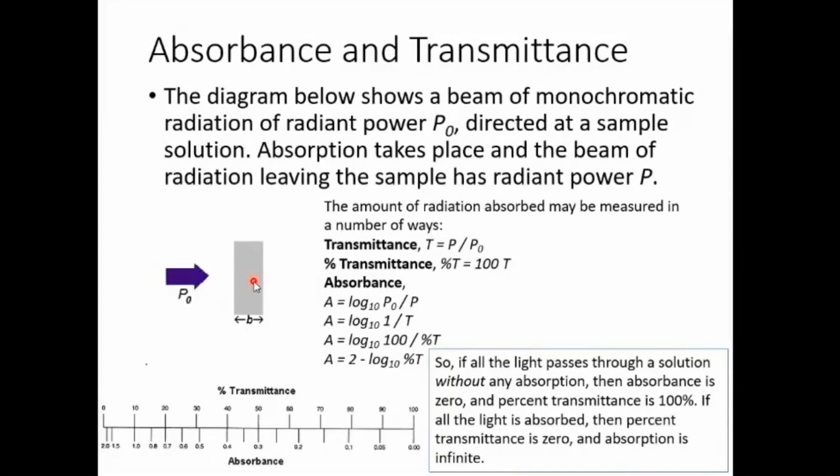Now, what do you mean by this absorption? If the energy of the electromagnetic radiation matches the energy difference between two molecular orbitals, the energy will be absorbed. The remaining portion which is not absorbed will be transmitted from the medium. It will come from the opposite side. So absorption and transmission are two phenomena.